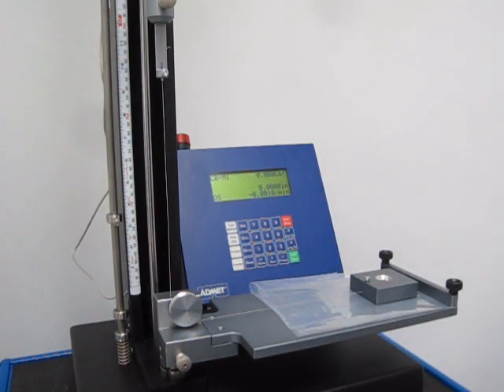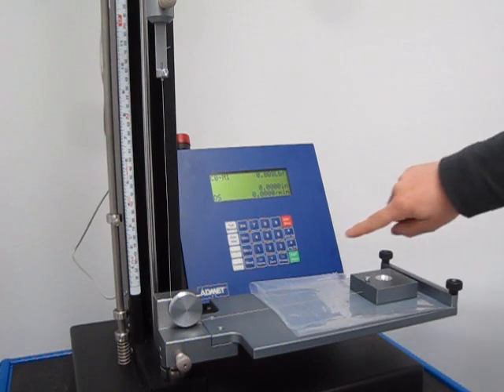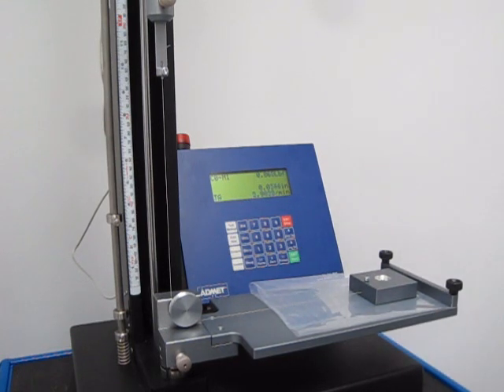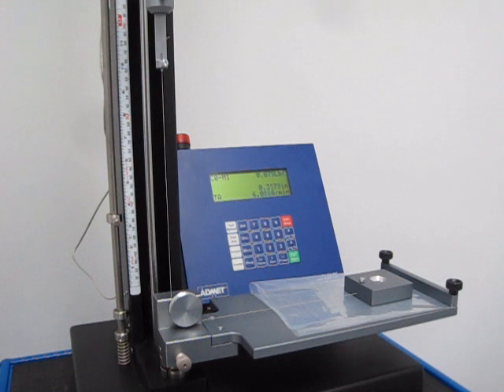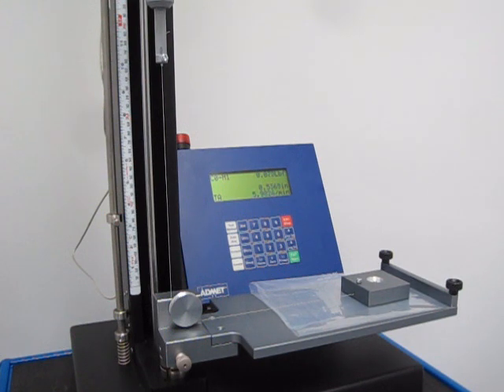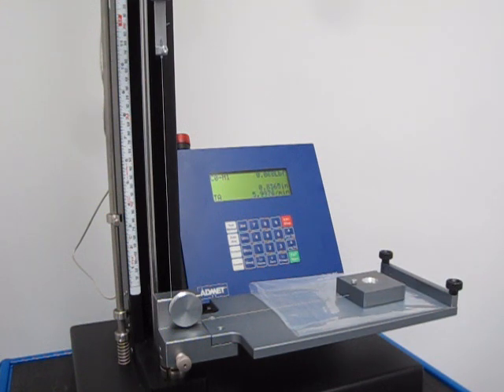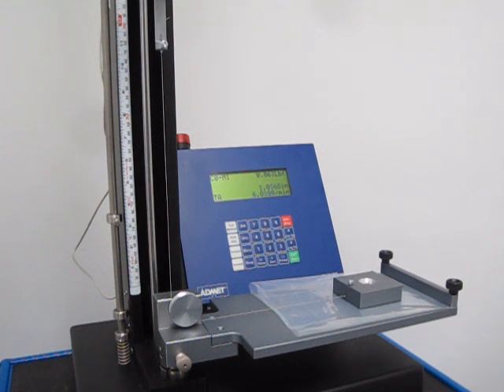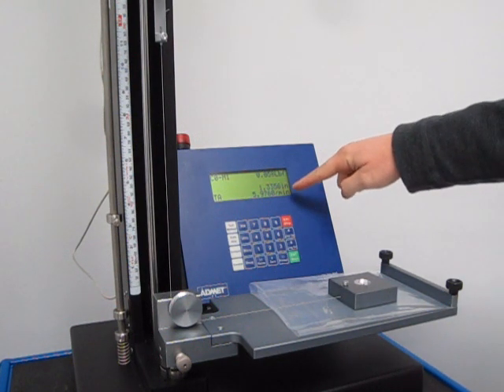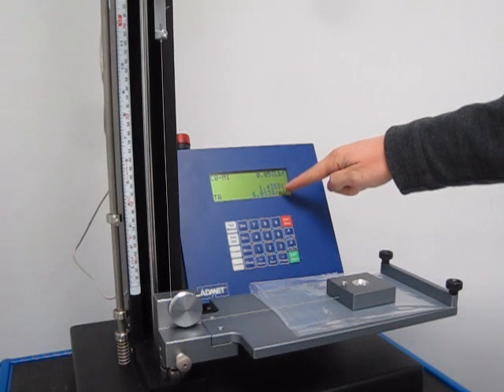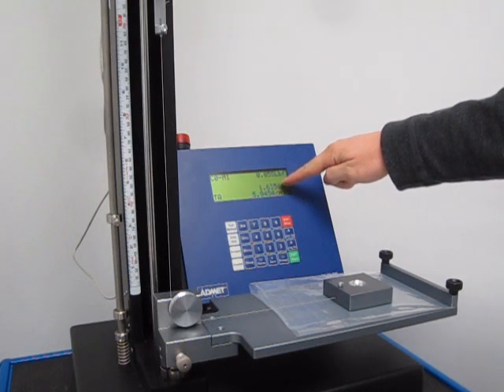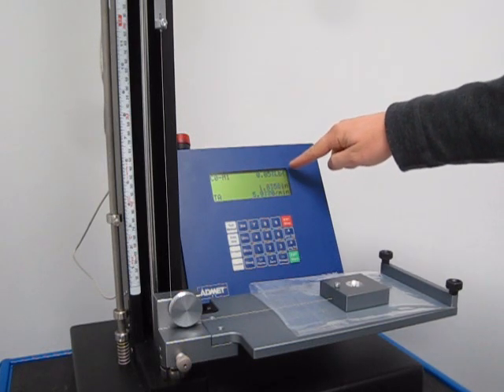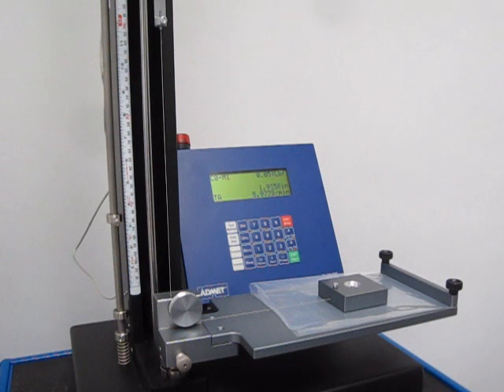We're going to hit the enter button and this test method is programmed to pull five inches at six inches per minute, so it's under a minute test. This is the current rate of speed, this is the current location which will go to five, and this is the current load.